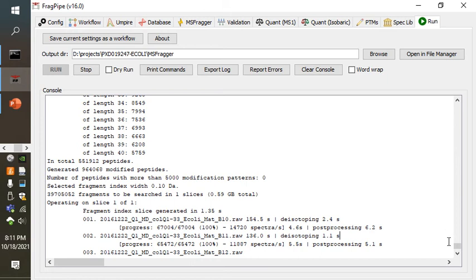Of course, there is a limitation on that because the libraries for reading the raw files are intended to run under Windows only. So it might be that you needed to start your search from mzML files instead on a different platform.